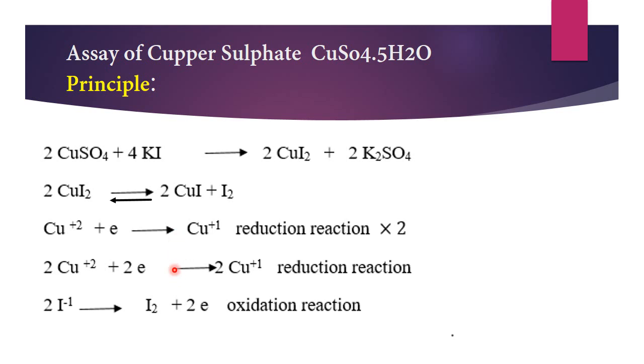التفاعل هنا هو redox reaction، يعني oxidation-reduction reaction ما بين البوتاسيوم ايودايد and CuSO4. so الCu هنا عندي الكبر ايون، اذا راح يصير بيه reduction reaction، يكتسب الكترون حتى يتحول الى كبرس ايون، او Cu+1. زين، حسب المعادلة بعد موازنتها راح نحتاج الى 2 مول of CuSO4 تدخل بالتفاعل. so اذا تضرب المعادلة في 2 راح يطلع 2Cu plus 2 plus 2 الكترون راح تعطيني 2Cu plus 1، 2 مول من Cu plus 1.